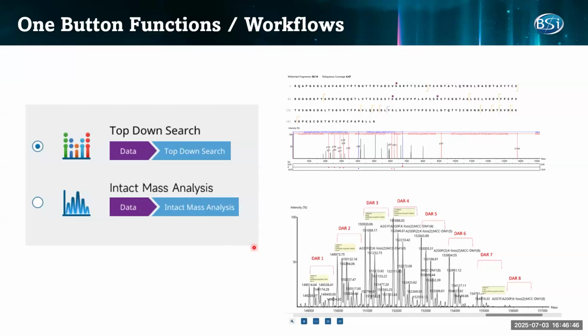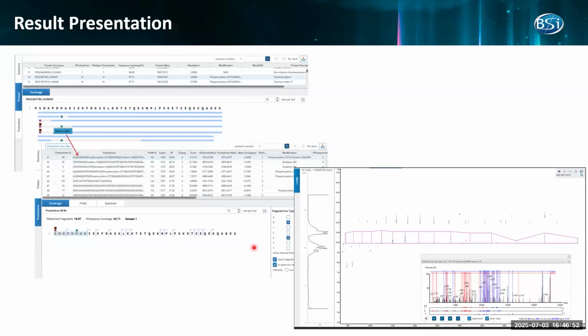Those are the two functions we currently provide in ProteoformX. And no surprise, the result presentation will follow the same logic we use in bottom-up.